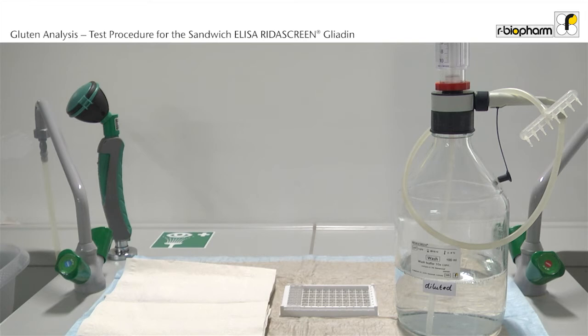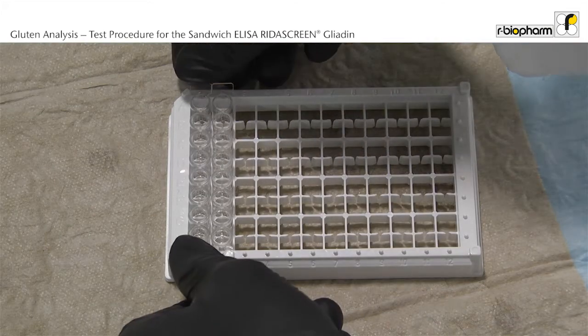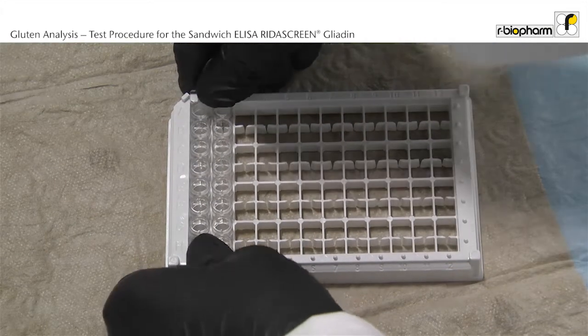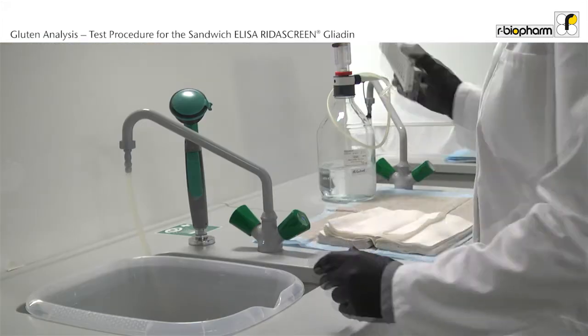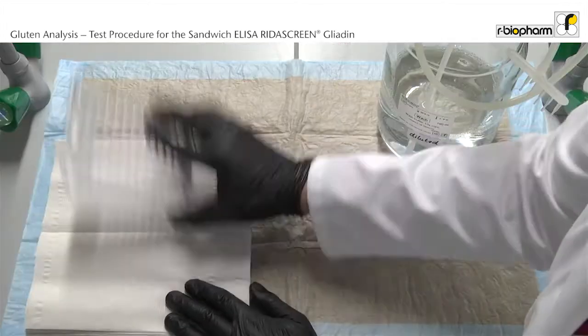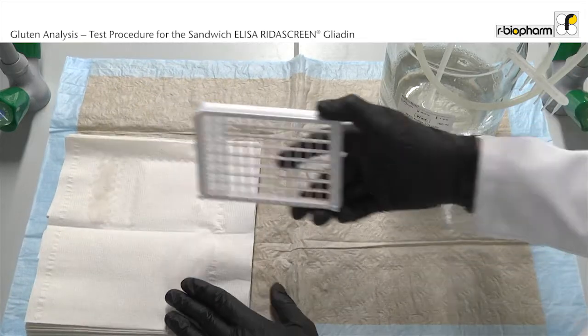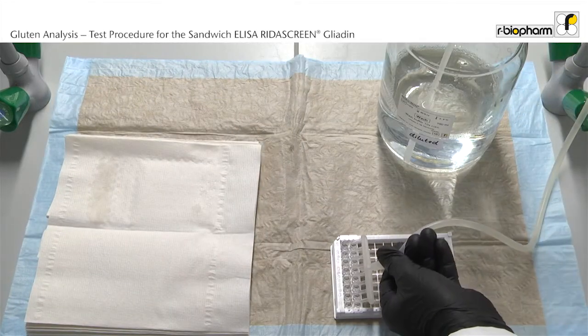After the incubation the plate is washed 3 times. The wash buffer has been diluted 1 to 10 in a clean bottle to which an 8-channel manifold dispenser is attached. Make sure all bubbles have been removed. Firmly press the frame to ensure strips will not fall out during discard. Discard the liquid from the wells using an angular and forceful motion to properly remove all liquid content. Vigorously tap the inverted plate on a dry and absorbing surface to ensure that all liquid content has been removed from the wells.